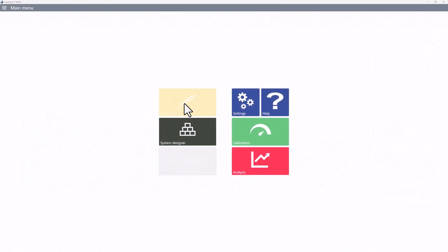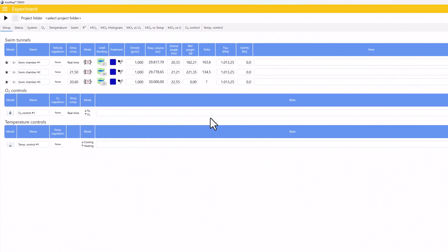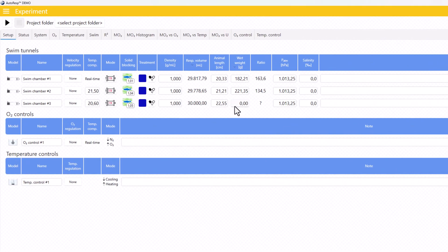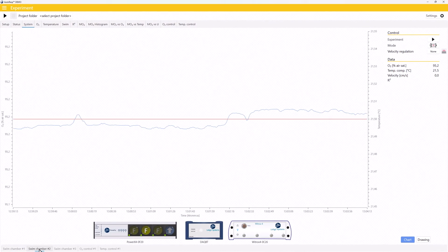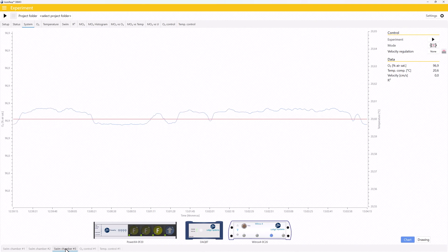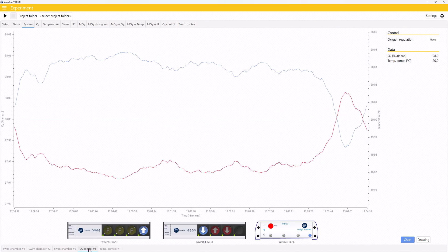It's now easier than ever to keep control of up to 20 resting chambers or 10 swim tunnels, all controlled from a single PC via wireless Bluetooth or LAN Ethernet cables.